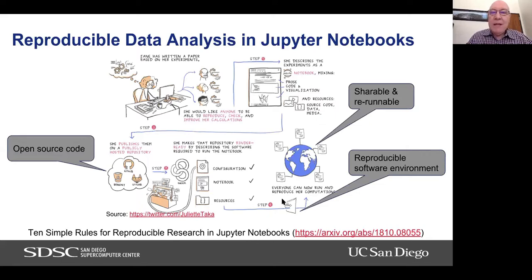Finally, you need to set up your software environment, and one way that is often done is through a so-called Docker image, where you define basically a reproducible software environment. And once that is defined, then this reproducible software environment can be run, for example, on CyVerse, and then shared with users around the world. It can be rerun and so forth.